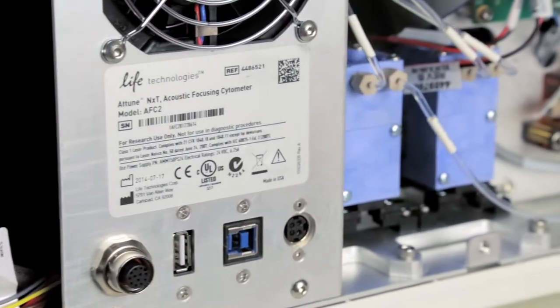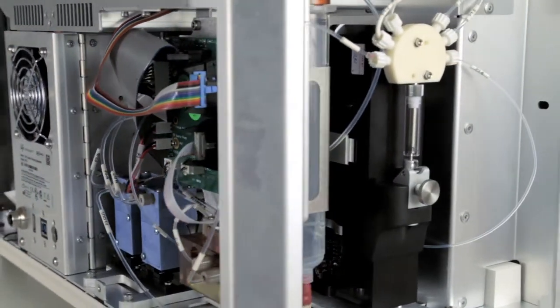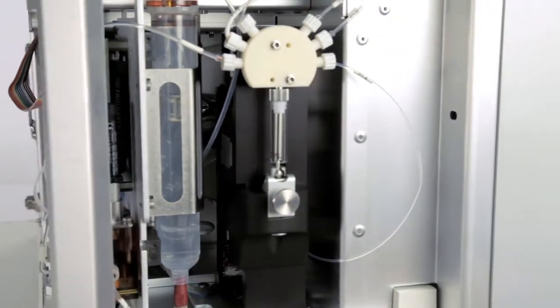The Attune NXT is syringe driven, so I can tell the system exactly how much to aspirate. Any sample that is aspirated but was not needed for my acquisition can be recovered or returned to me if I want it.